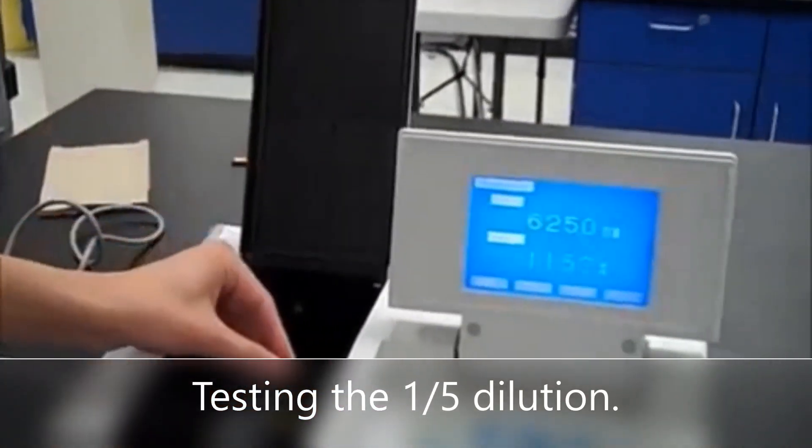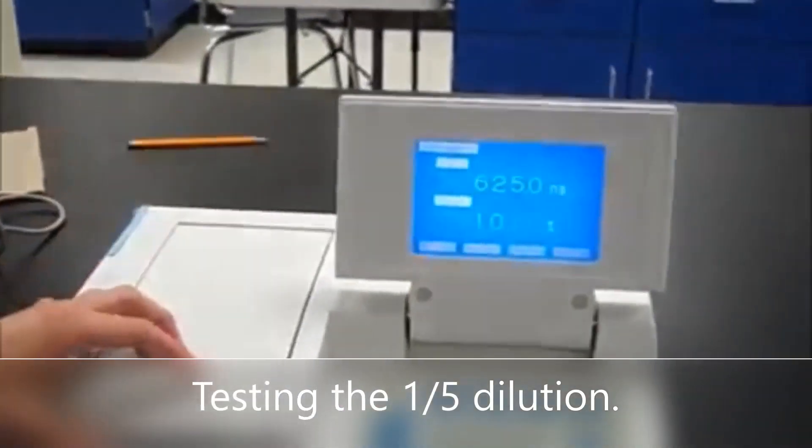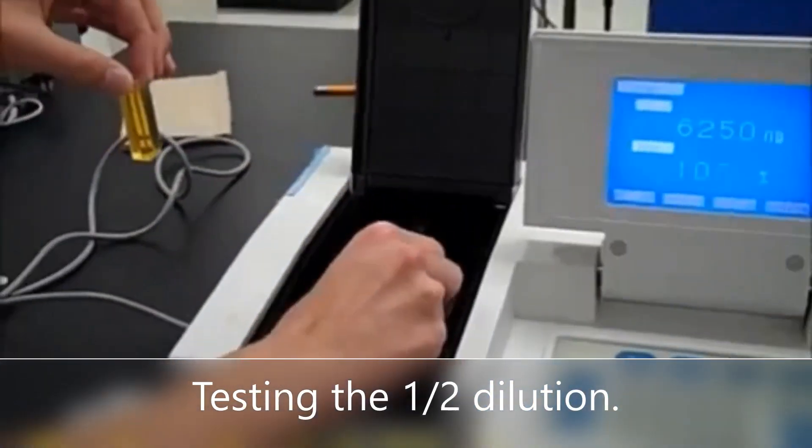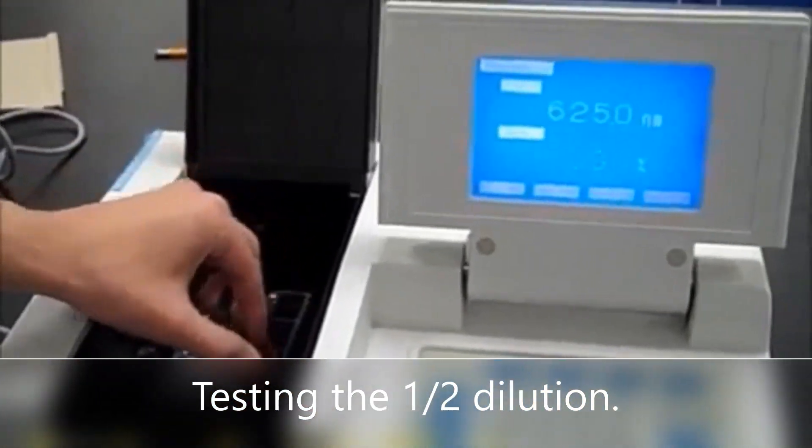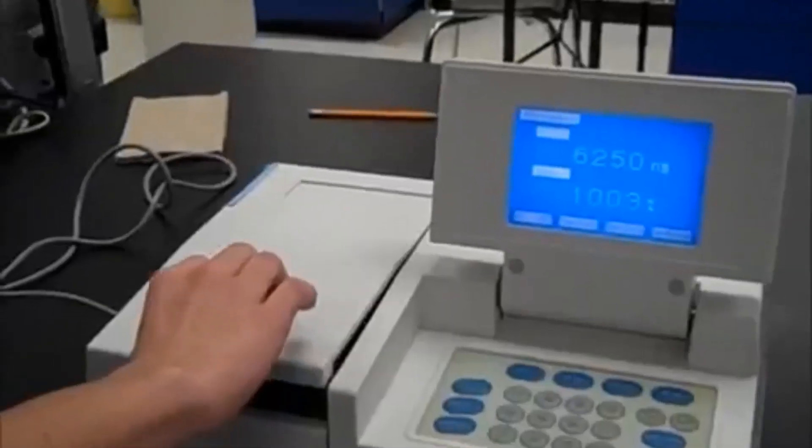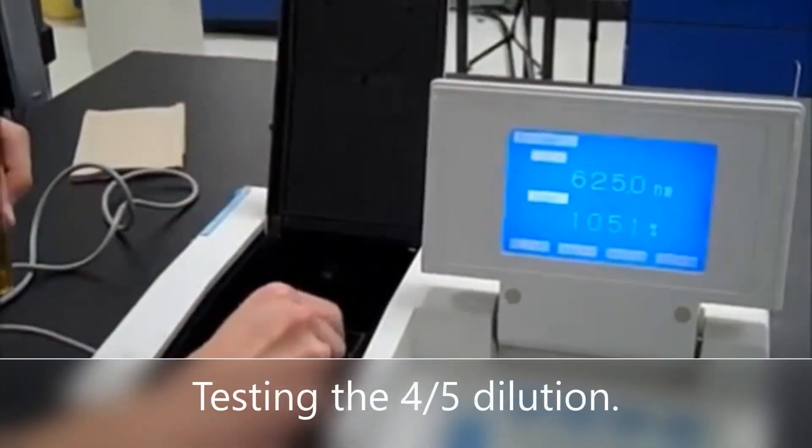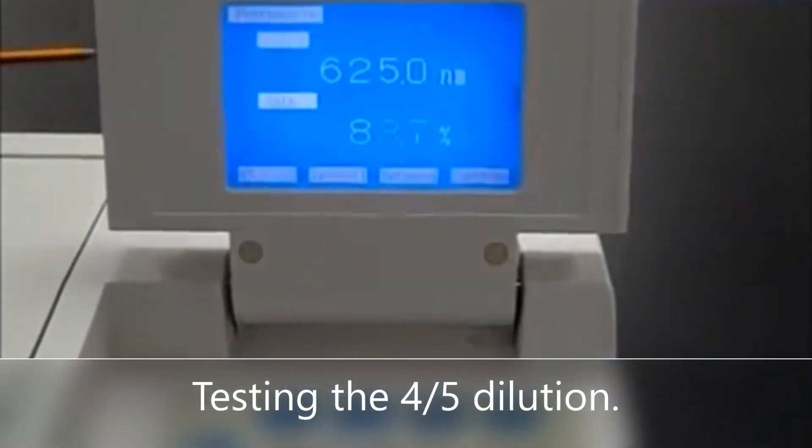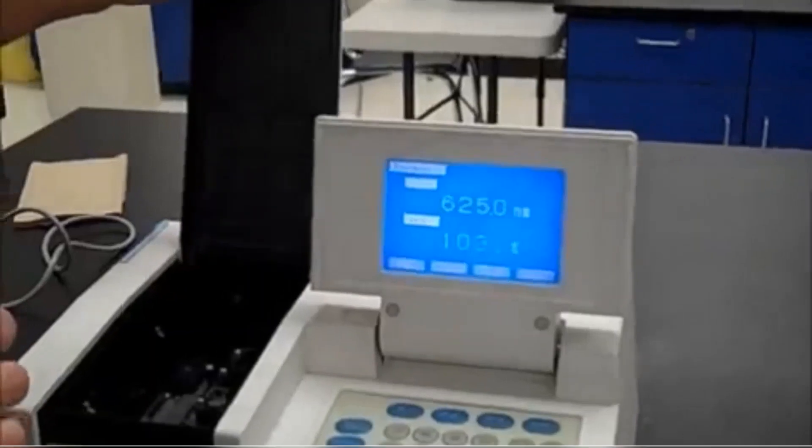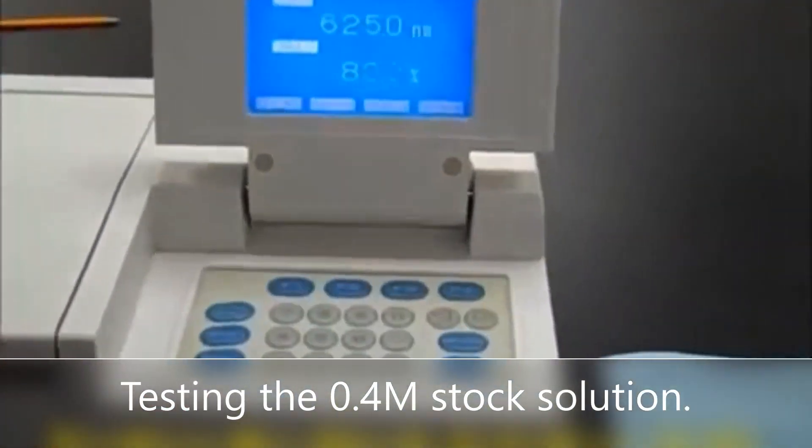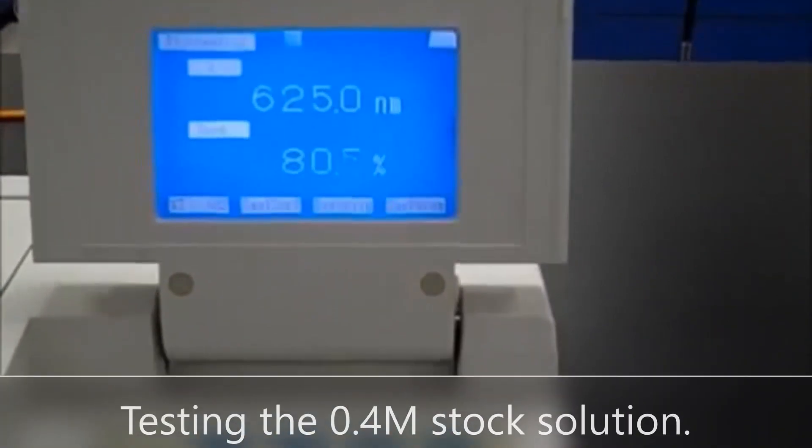Next we'll test the one-fifth dilution. The transmittance for this sample was 96.3. The one-half dilution sample had a percent transmittance of 90.3. The four-fifths dilution sample had a percent transmittance of 83.8. And finally the 0.4 stock solution had a transmittance of 80.6 percent.